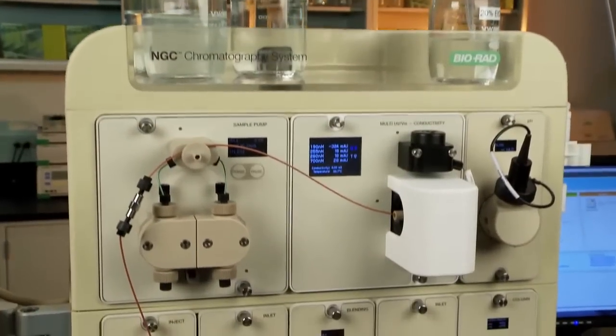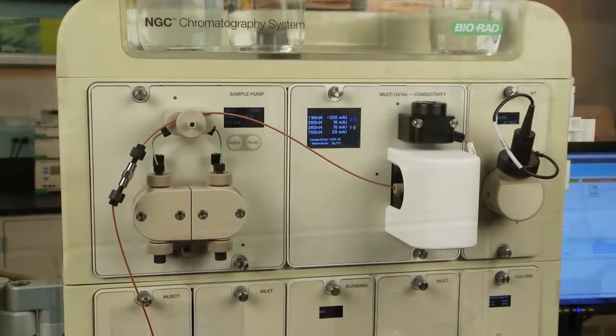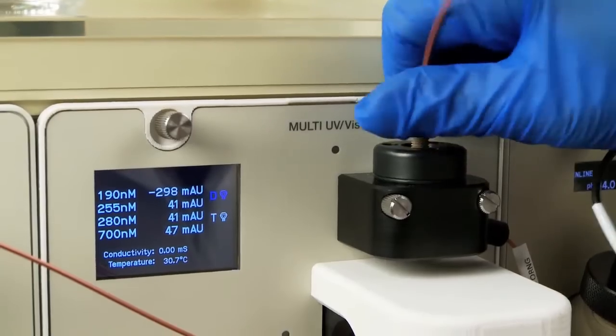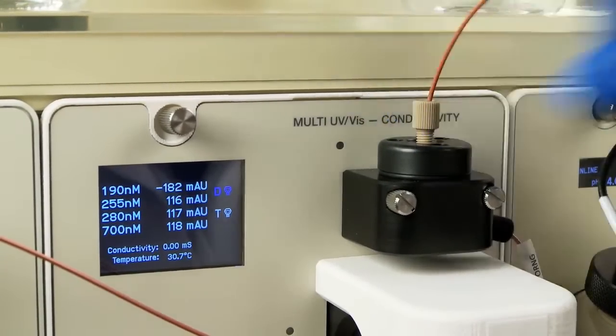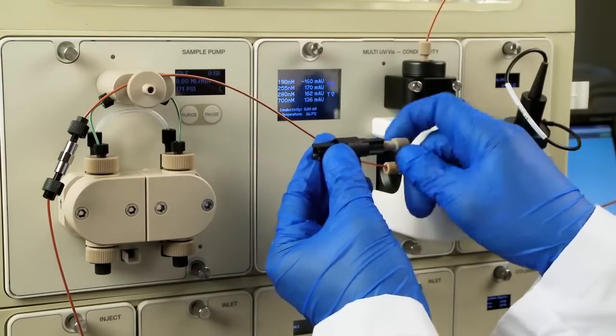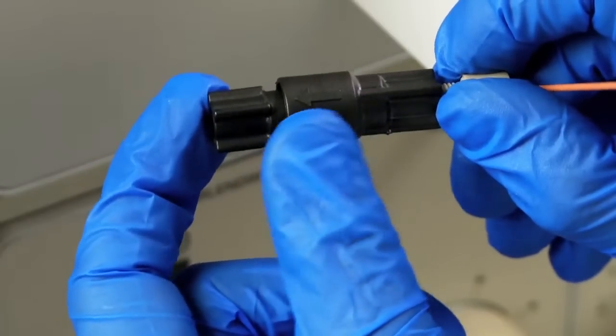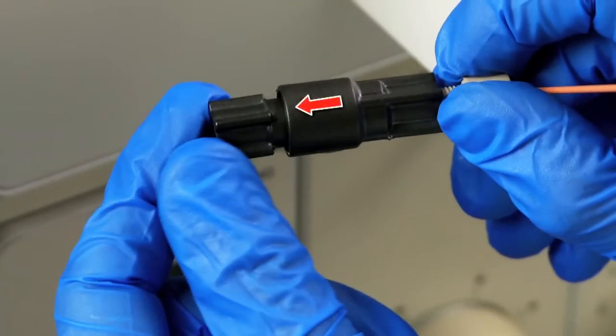Now you will attach the back pressure regulator. Connect line number 2 into the top of the conductivity monitor and then connect the other end into the 40 psi back pressure regulator. The arrow on the body of the regulator should point in the direction of flow.